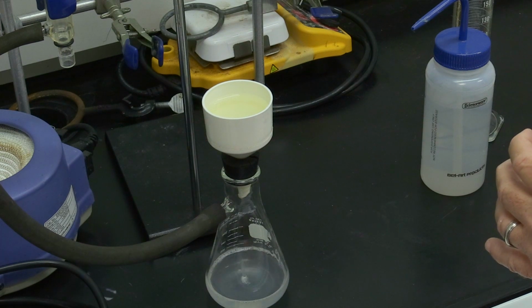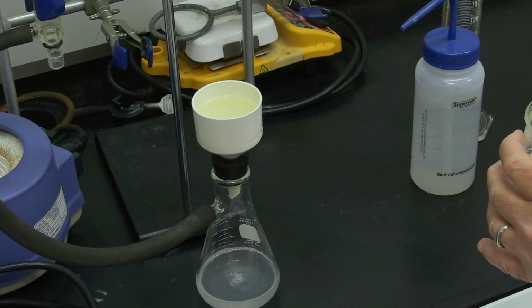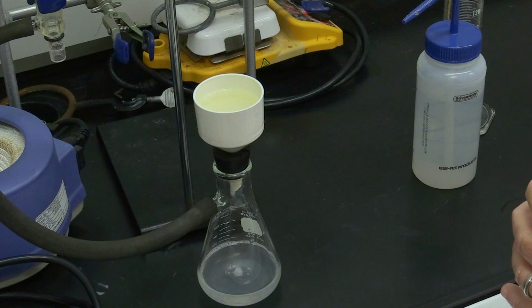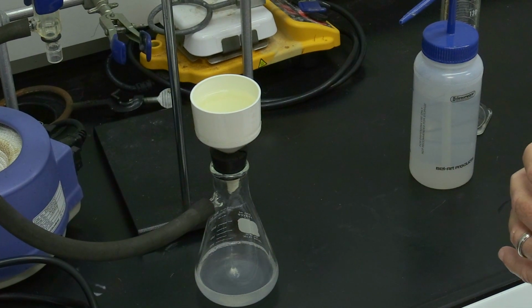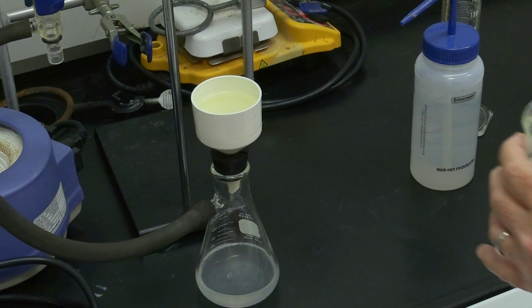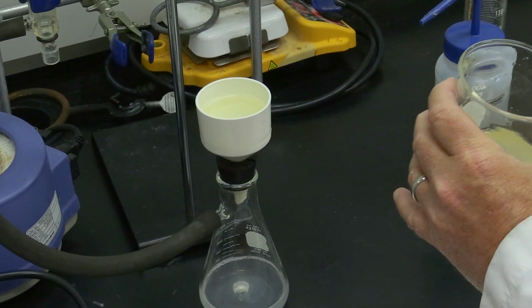Depending upon the pore size of the filter paper, it might take a little longer to filter this material because of the particle size of the product.